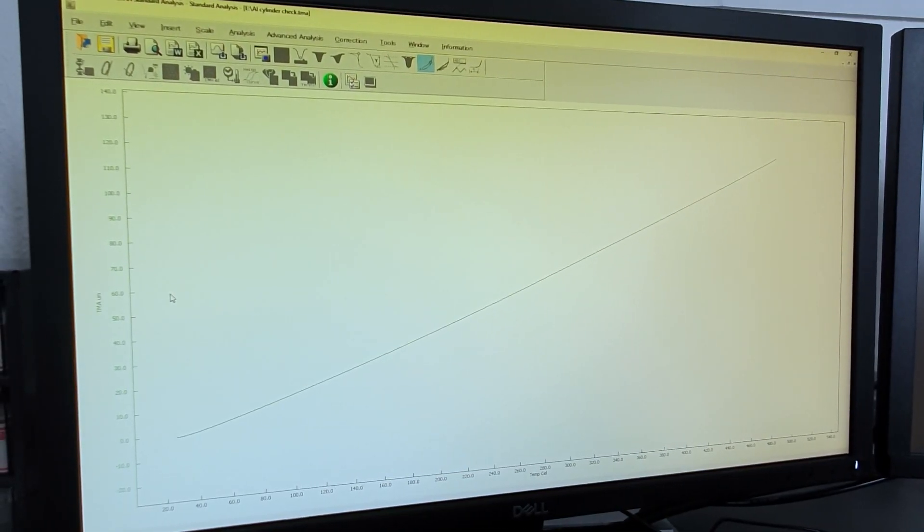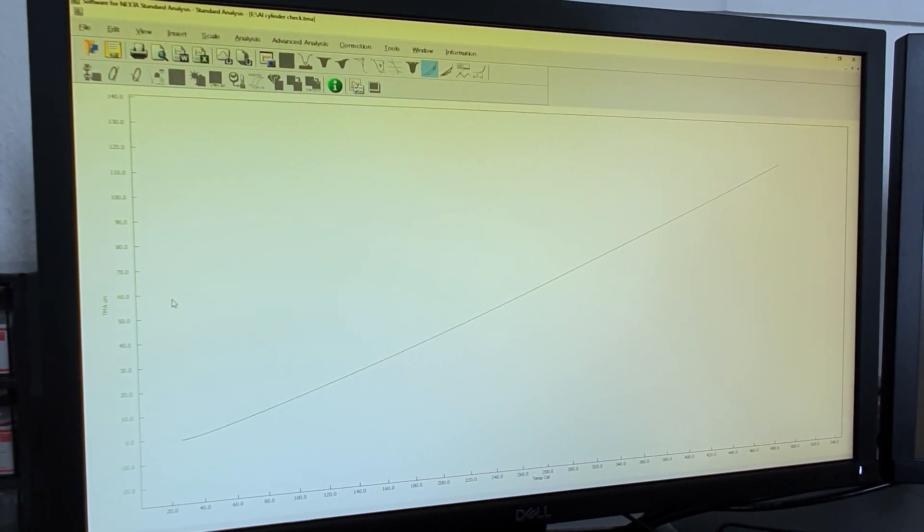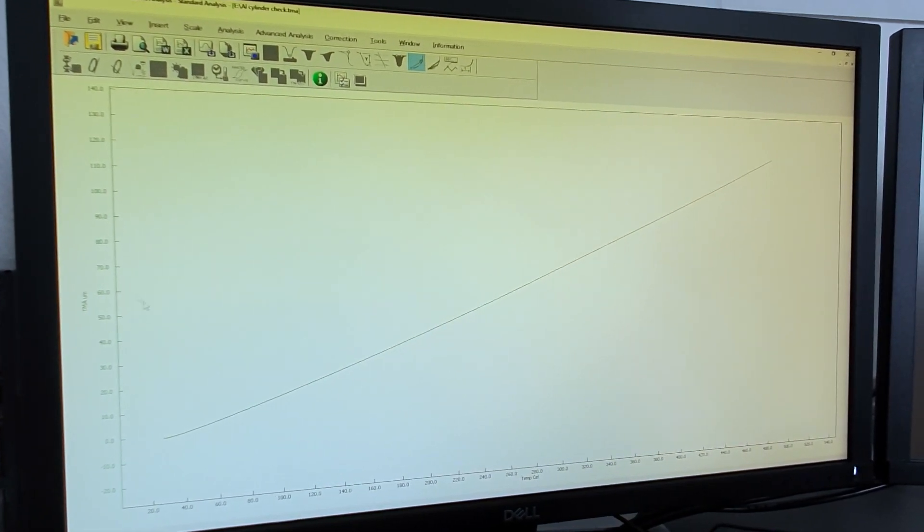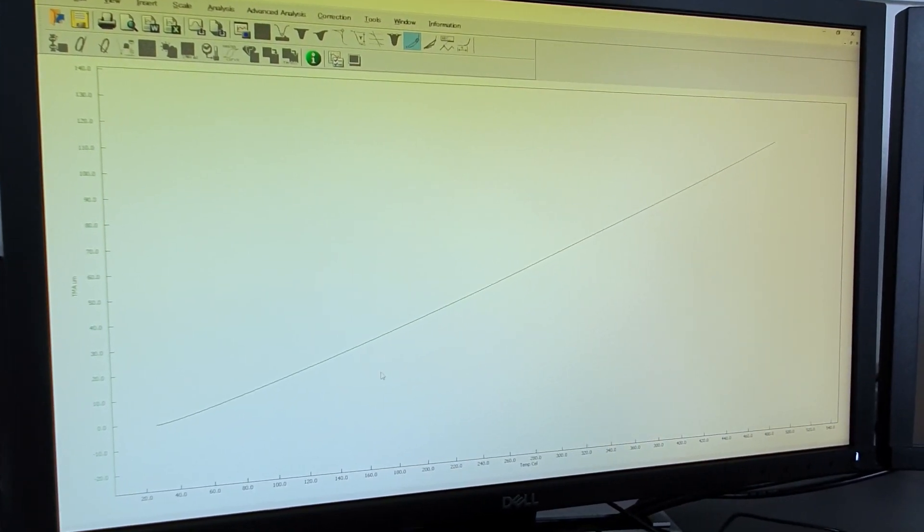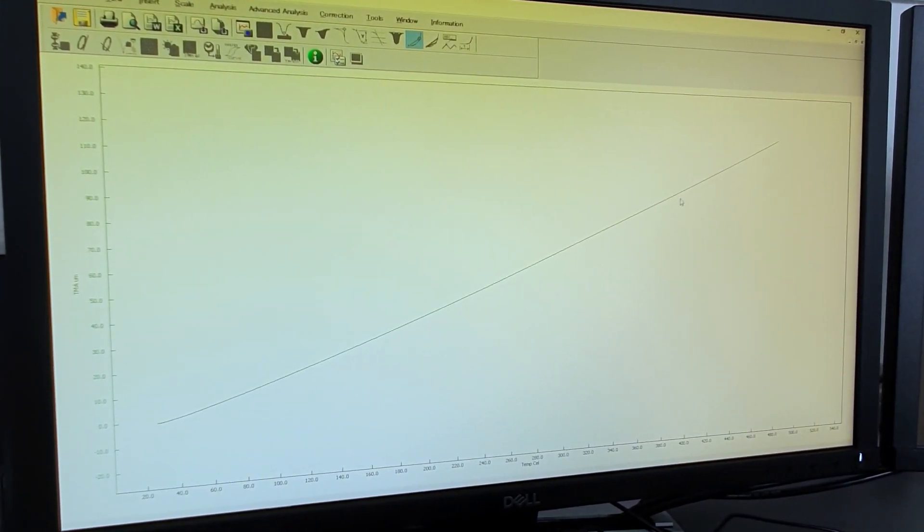Here you can see typical TMA data in our software. On the y-axis you see the TMA data, and on the x-axis you see the temperature. As with rising temperature, you can see that the sample itself expands.